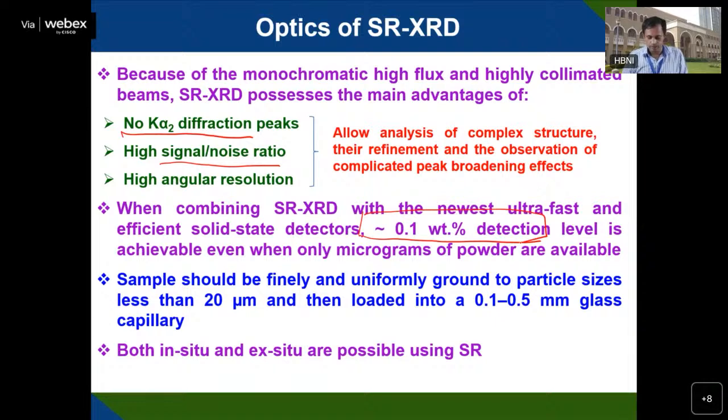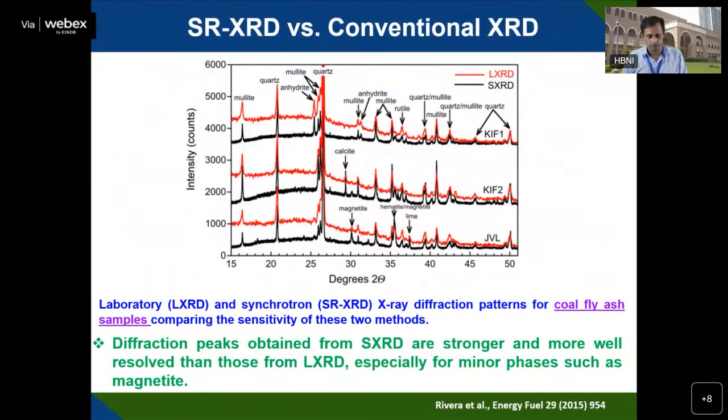And you can do both in situ and ex situ measurement. During the process, you can do high temperature experiments and pressure-based studies. Those are possible with synchrotron radiation.